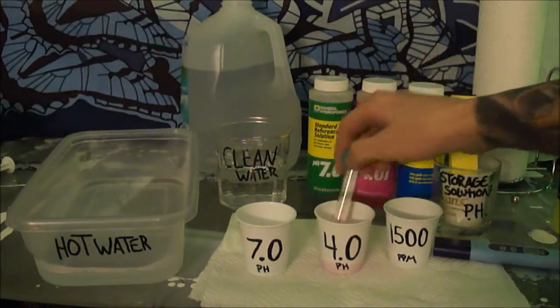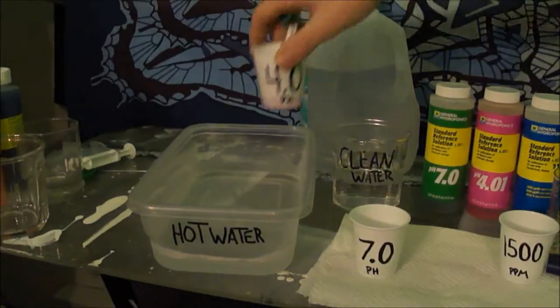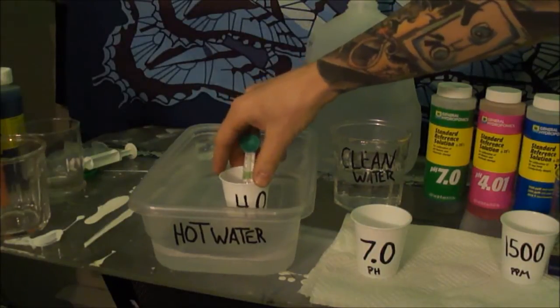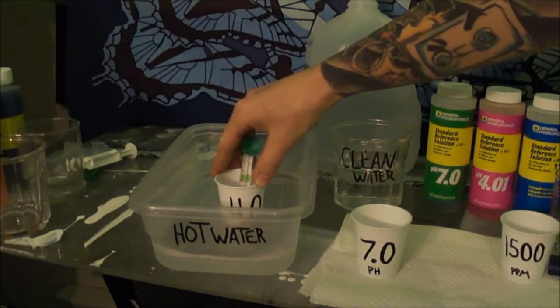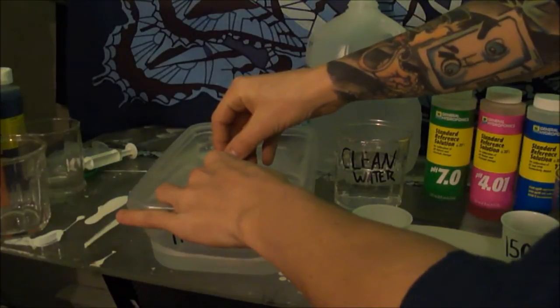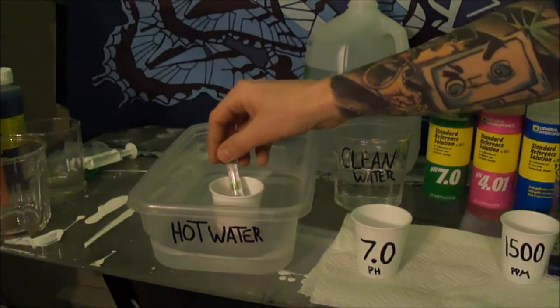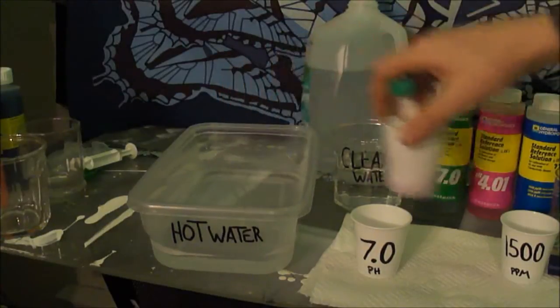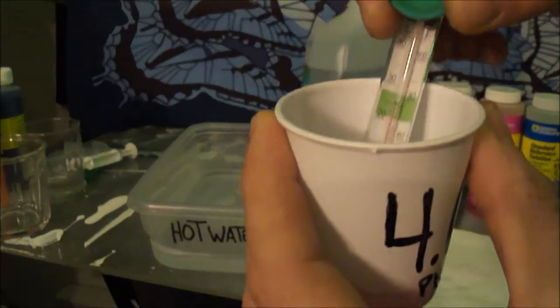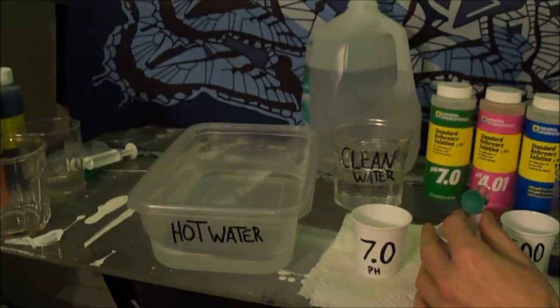You're going to take your cup and your thermometer, put it in there, and then put it in the hot water. The reason you do this is because you test these at 25 degrees Celsius, which is 77 degrees Fahrenheit. Once it's just a couple degrees away I take it out of the water because it'll keep heating up. It's about 76 degrees right now.